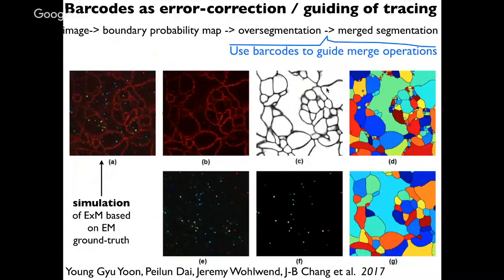If you imagine you have a kind of crude optical approximation of the morphology, but still at relatively comparable spatial resolution, and you also had barcodes indicating the cell identity in a unique way. So from a single point, wherever you see a barcode, you could uniquely determine the identity of that point, but perhaps of nowhere else.